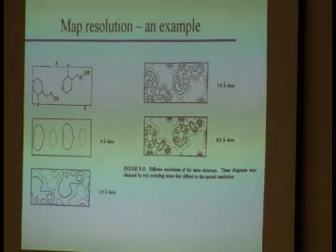Probably, right? There's obviously a ring here. There's something sticking out of the ring there and there. Something short and something long. Well, there's a ring, there's something sticking out, something short and something long. So yeah, it's not pretty, I agree, but you could place that molecule. So that shows you that indeed, if you have data that is about 2 angstrom resolution, you might be able to work with it if you know your atomic connectivity, okay? Because then you can define this thing as a unit, and you let the program refine how the unit should be rotated, where it should be placed.